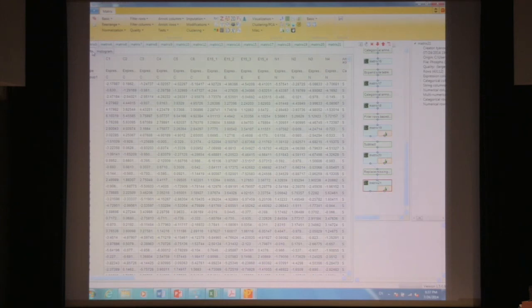I'm just wondering, because imputation is a risky business, right? If you want to use a standard thing, then I guess what is most frequently used is k-nearest neighbor imputation, but that works really, really badly. So we just came up with something that works very, very well for our kind of data, and we highly recommend using that.